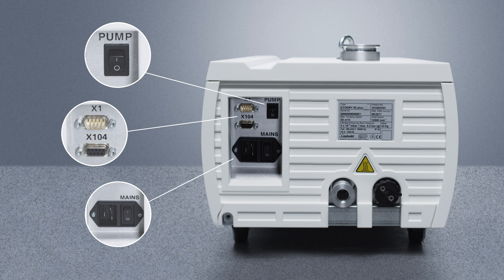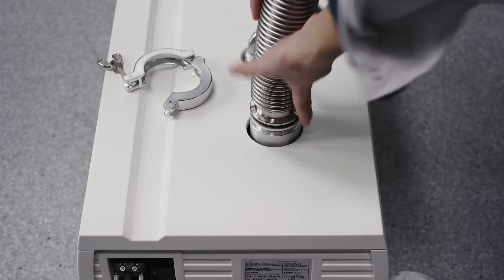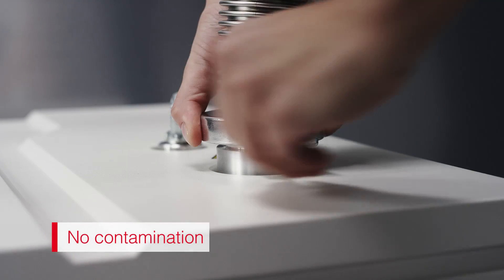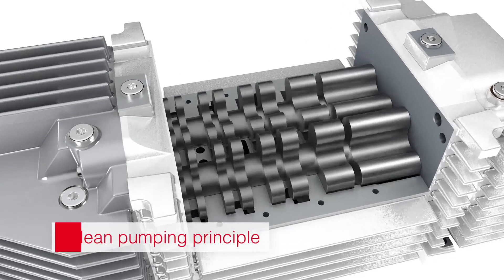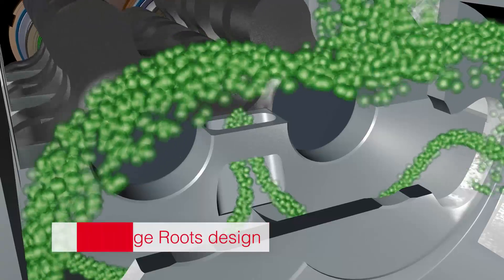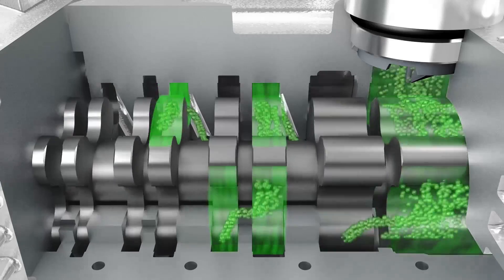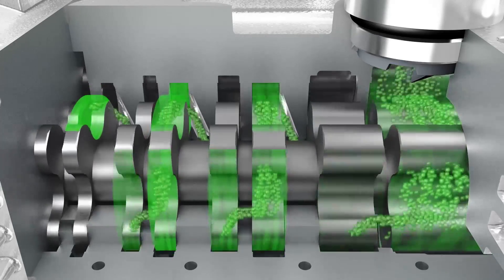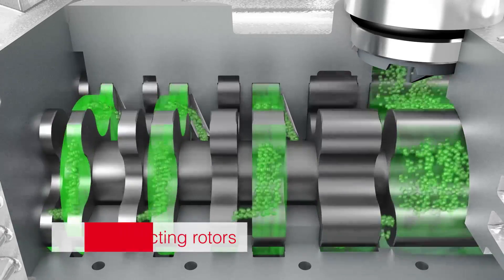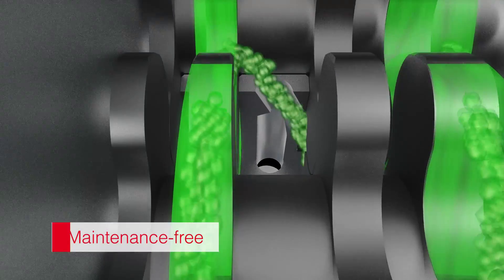When you connect the eco dry plus to your vacuum chamber, you can rest assured no oil or dust will contaminate it — because this dry pump needs no oil and produces no dust. Thanks to our clean pumping principle, it is based on a multi-stage roots design: two rotors turn in opposite directions at high speeds, compressing the gas as it moves through several chambers until it is discharged. The rotors do not touch each other or the housing, keeping your pump wear and maintenance free.